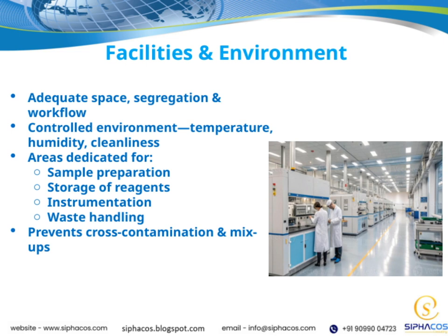Controlling the environment is equally vital. Maintaining consistent temperature, humidity, and cleanliness helps preserve sample integrity and ensures reliable results. We also need designated areas for specific tasks. For example, a dedicated space for sample preparation helps keep samples uncontaminated.